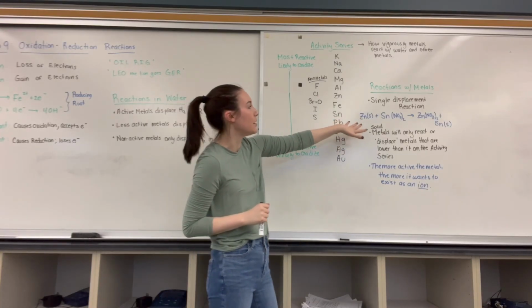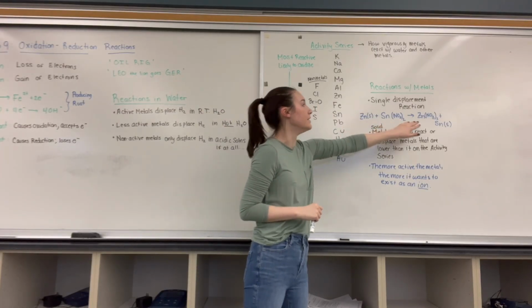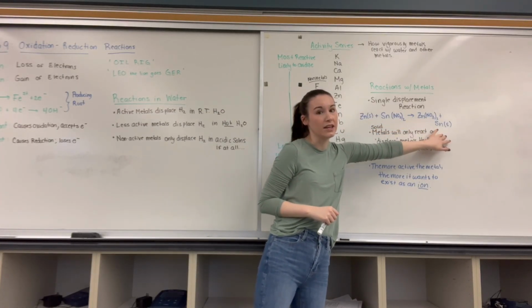So let's look at the example I have here. Zinc solid reacts with tin nitrate to give zinc nitrate and tin solid.